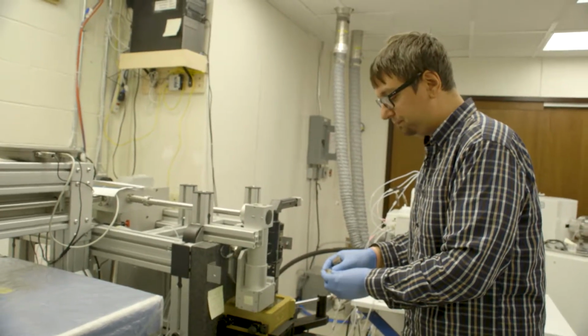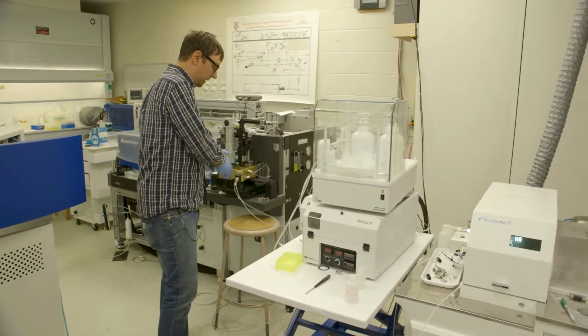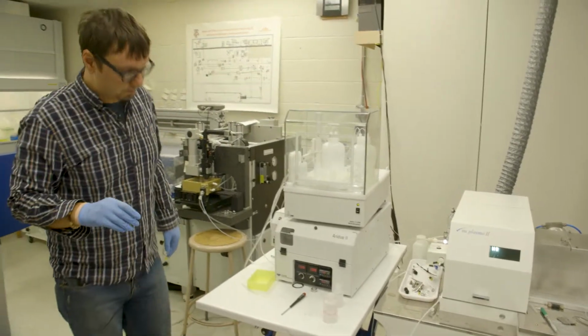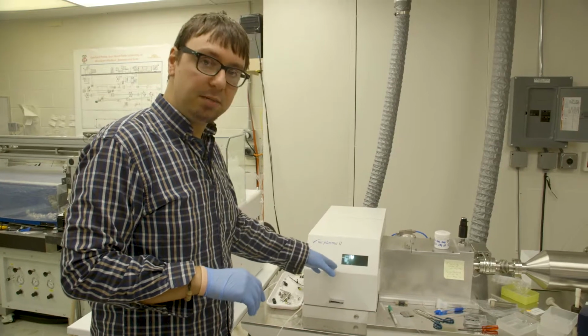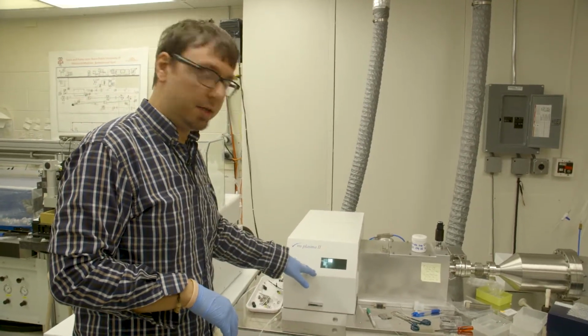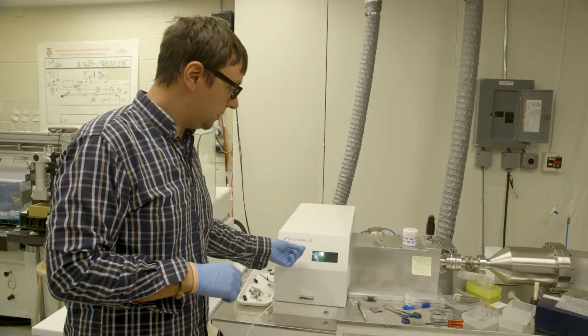isotope composition. Once the material is ablated by the laser beam, it travels through tubing to over here to the mass spectrometer. Here, the small particles are introduced into the plasma, which is burning at essentially about 8,000 degrees Celsius. That ionizes and atomizes the particles.